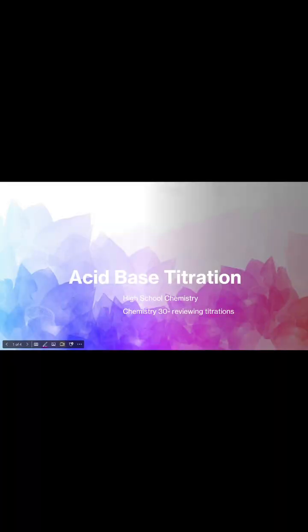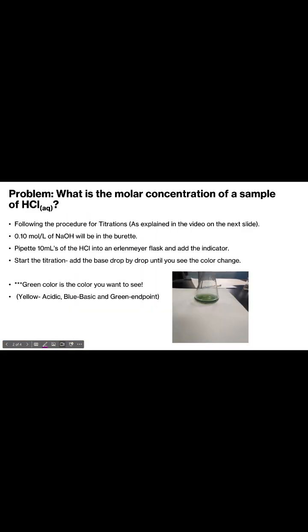Okay, so today I did an acid-base titration with my Chem 30s just to practice all the titrations we will be doing this semester. While I was doing it, the question was, what is the molar concentration of a sample of HCl? So that's what we want. I have, following the procedure for titrations as explained in the video, it does say the next slide, but I will add it in at the end.